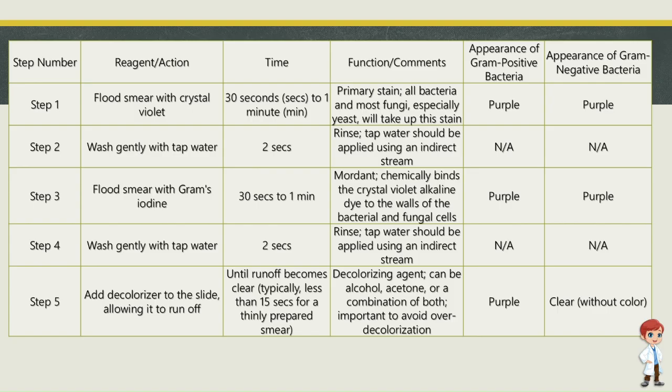Step 4. Reagent/action, wash gently with tap water. Time, 2 seconds. Function, rinse, tap water should be applied using an indirect stream.